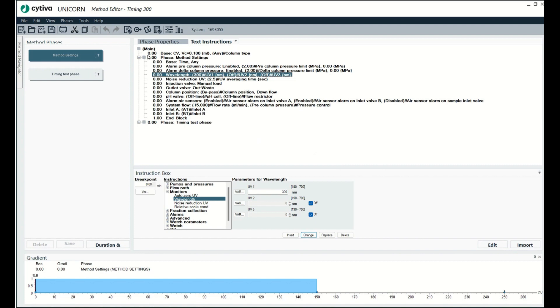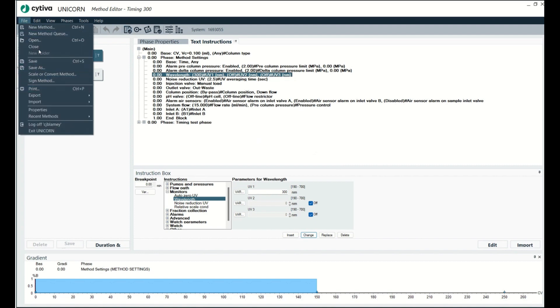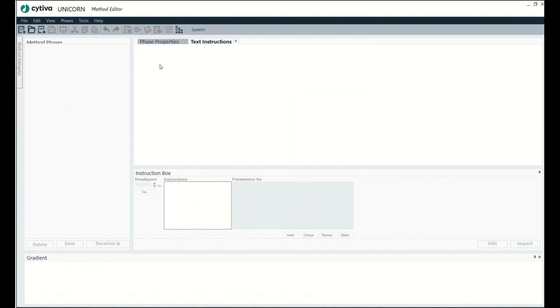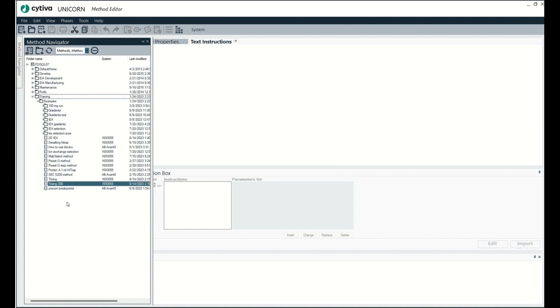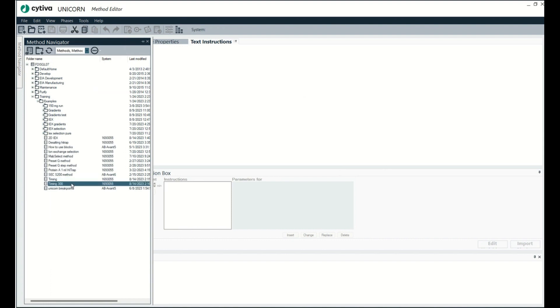All right. Now that I've done that, I'm just going to close this really fast. Close. So now I have two files here. Timing, which is locked, and timing 300, which is not locked. I'm going to just delete this file.